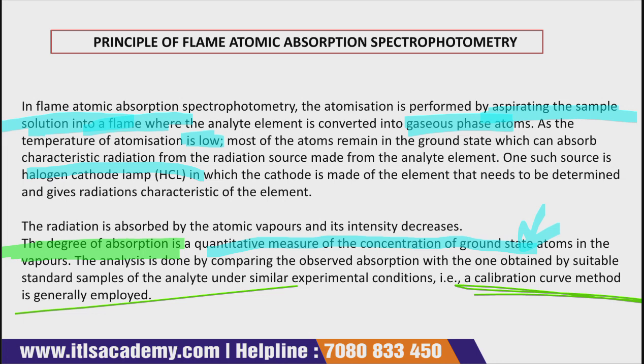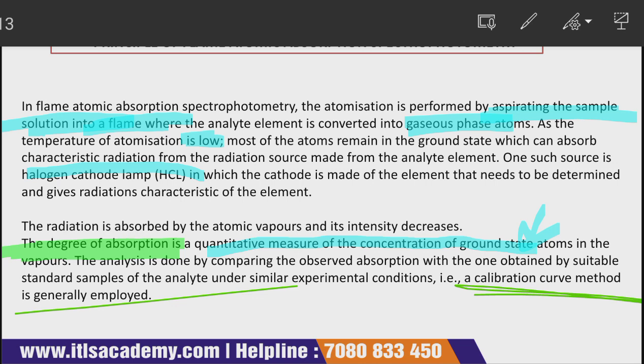Now understood. So in this slide, different types of questions can be made. The first question is, of course, they can ask you to explain the principle of flame atomic absorption spectrophotometry. The answer for this is in this slide, so you can go through this slide. Again, in simple words, I am repeating the principle.